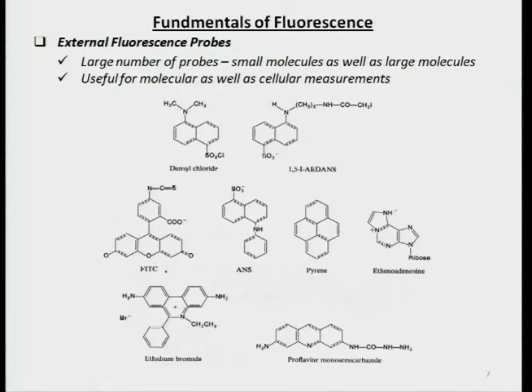External probes are also fairly useful. External probes can be small molecules. In addition, external probes can also be large molecules. External probes may be non-covalently utilized or may be covalently utilized. So either of those cases.